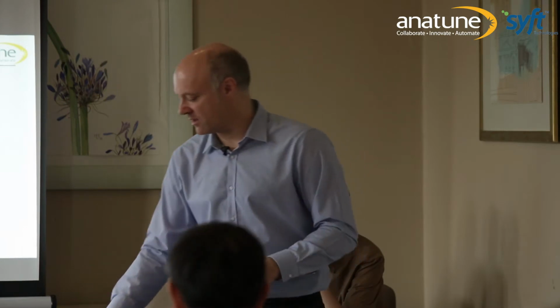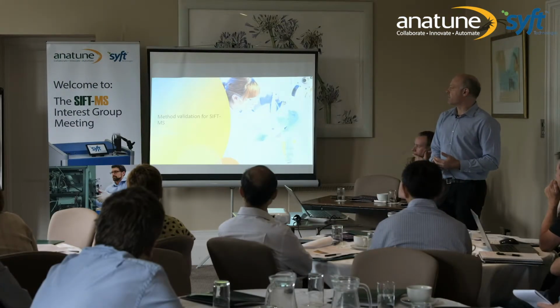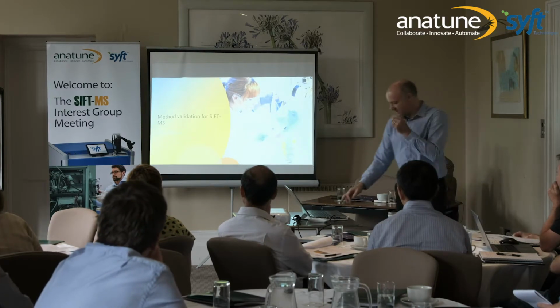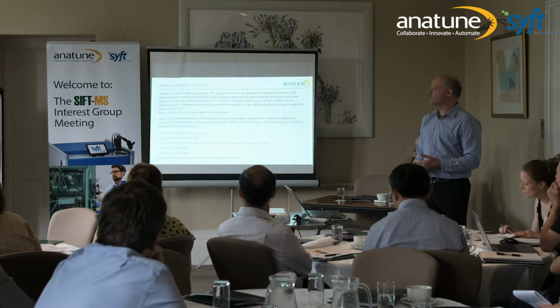So we can expect good measurements even if there are small changes in the environmental conditions of the instrument. Next part of the validation exercise is looking at limits of detection, limits of quantification. Now, anyone that has used SIFT-MS knows that limits of detection and quantification on SIFT-MS are somewhat of a movable feast. The longer you measure for, the lower you can push these limits. It's not set in the same way.